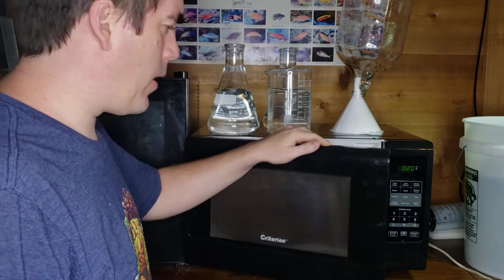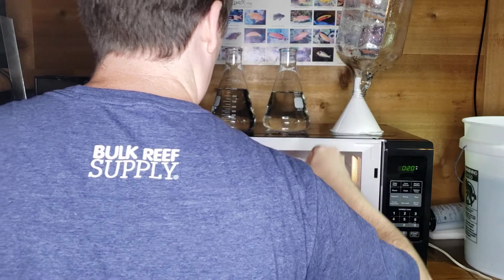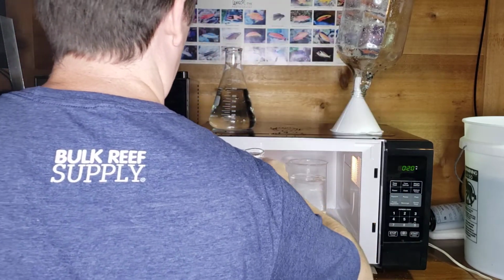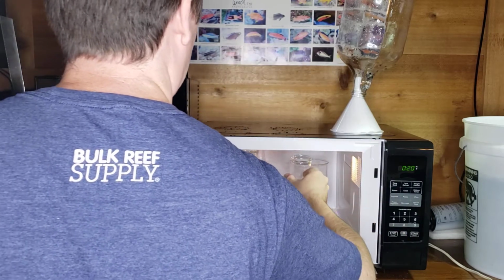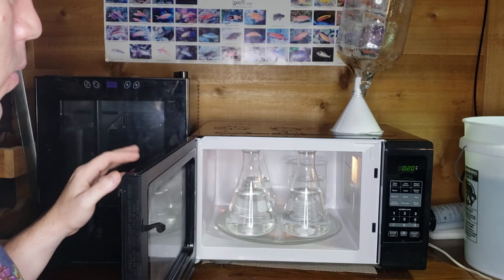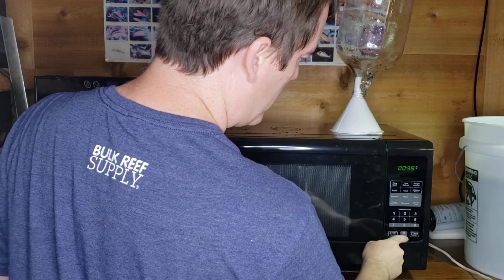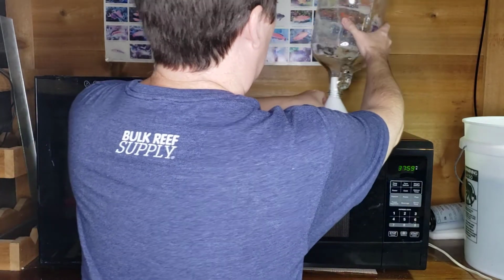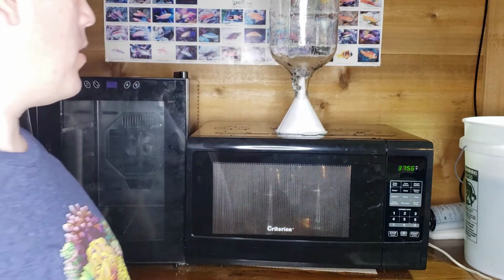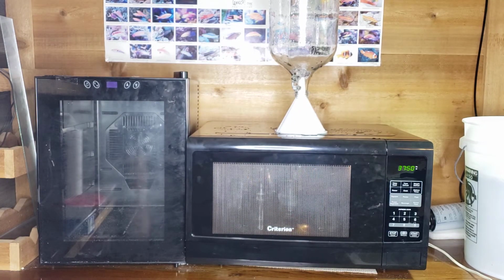Alright, so this right here is going to be our microwave. I had to pick one that was big enough to fit all 4 beakers. So just place these inside. So as you can see, we can fit roughly 1 gallon of water in the microwave. Set the time, I go 38 minutes. And up here I've got one of our jugs just dripping, so we don't have any excess fresh water inside. I'll come back here when it's done.